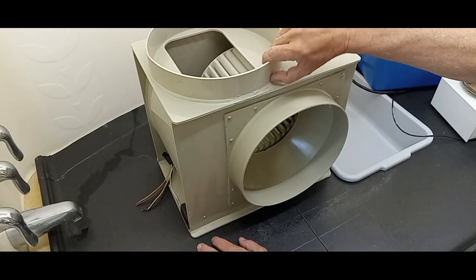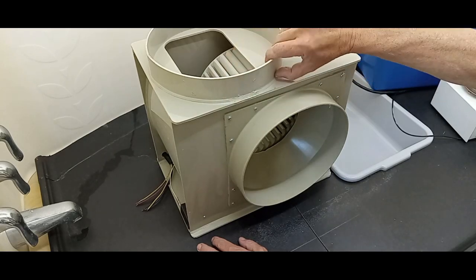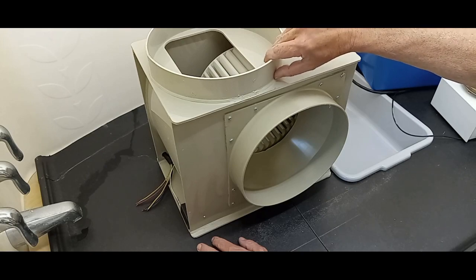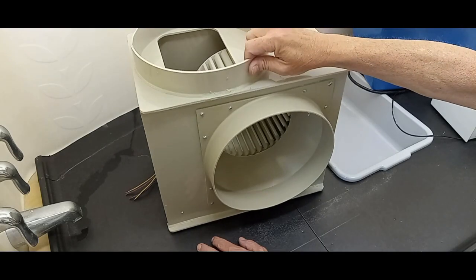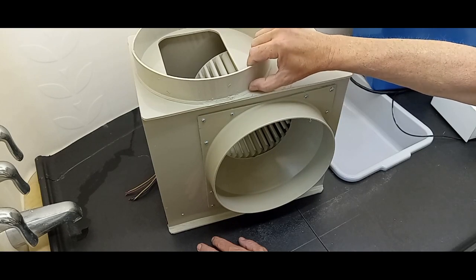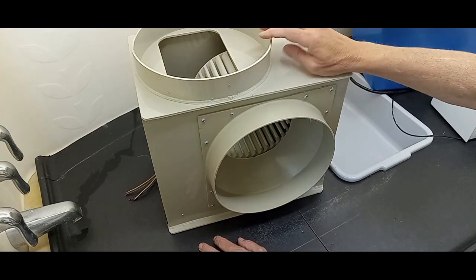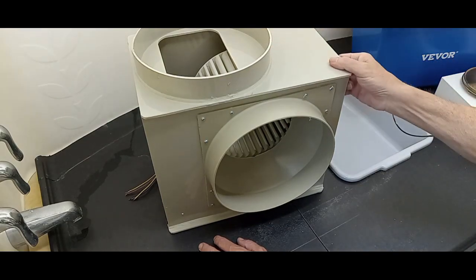Somehow they welded these seams. They're not cemented, that's actually a weld of the plastic itself, it almost looks like. Either that, or they have a machine, a hot machine, that extrudes the same polypropylene, supposedly. Kind of like a bead of caulking, not sure how they do that.